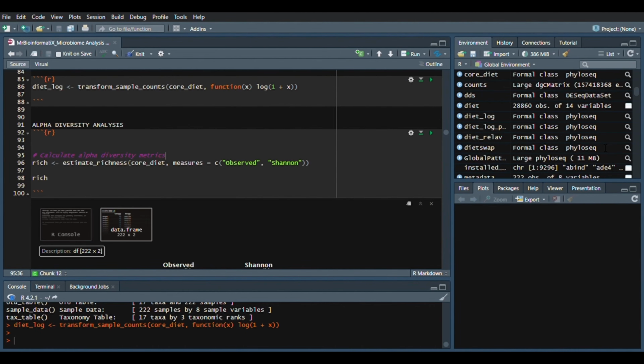And regarding Shannon diversity, it doesn't only count unique species, but also considers how evenly the individuals are distributed among those species. For example, if one plant type dominates the garden while others are sparse, the Shannon index would be lower than if all plant types were equally abundant. A higher Shannon index suggests a balanced community, where no single species is overwhelming.